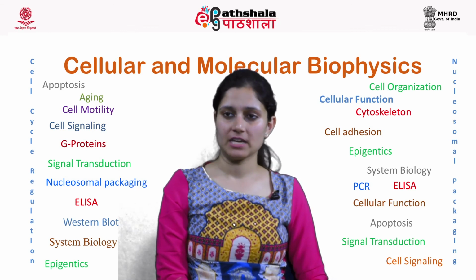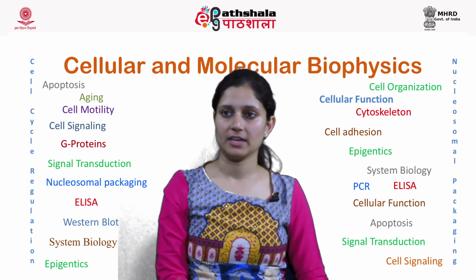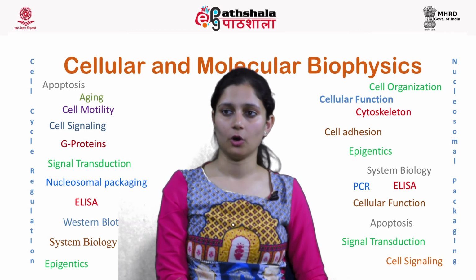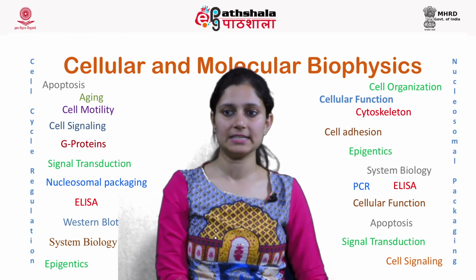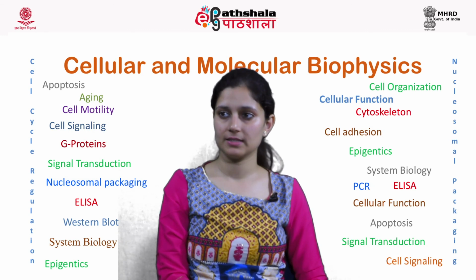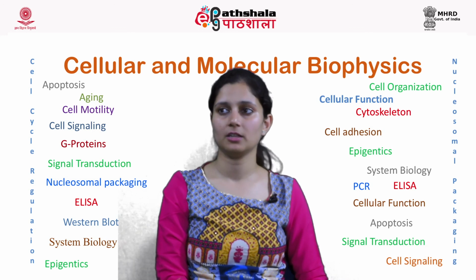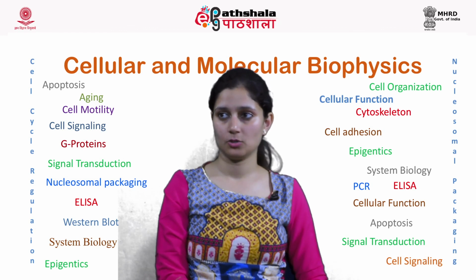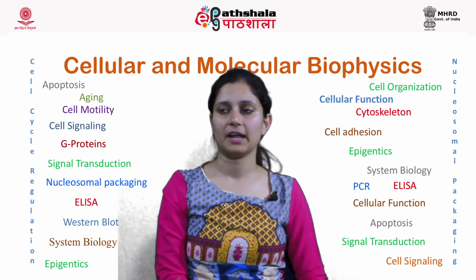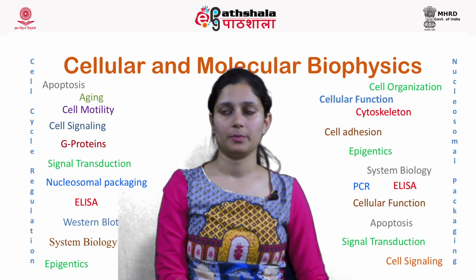For detection of HIV viral load, RNA is isolated from blood of suspected HIV patients. Reverse transcription PCR is done from RNA of all suspected patients, and PCR for HIV P24 is put using the cDNA formed. You can see in this picture that there are 4 patients, the samples of whom have been run in the lanes of this gel: lane A, lane 1, lane 2, lane 3 and lane 4. You can see a bright band in lane 1 which is suggestive of HIV P24 presence.